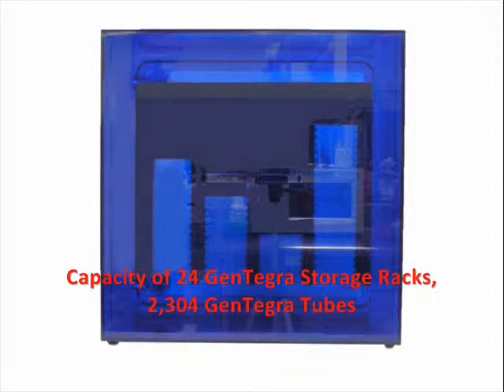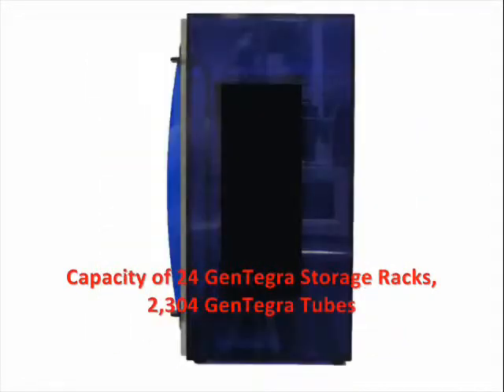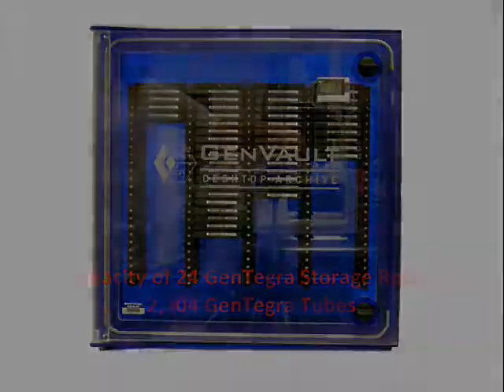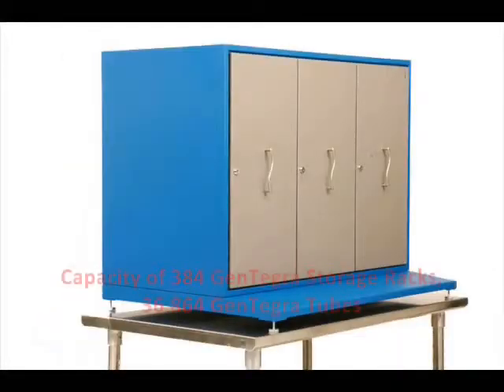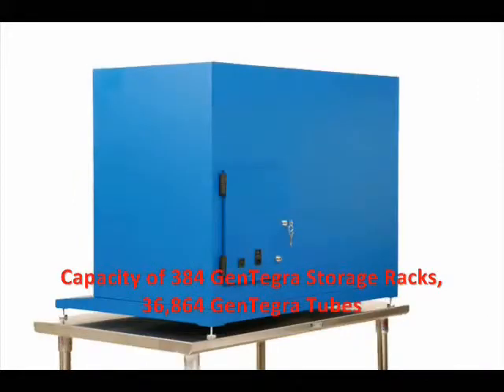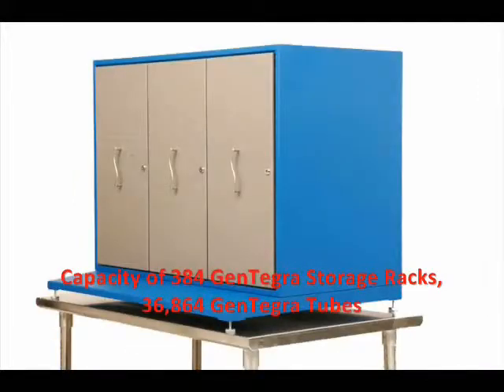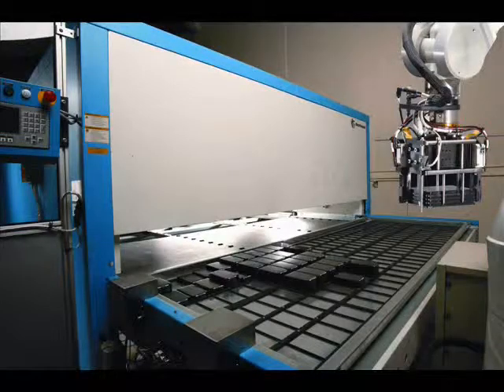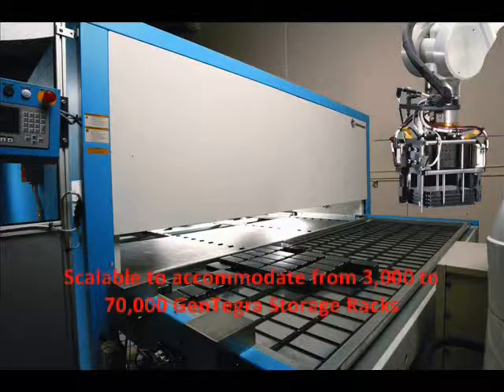Genvolt's desktop archive, our small storage cabinet, holds up to 24 Gentagra storage racks or 2300 tubes. The personal archive, our medium storage cabinet, holds up to 384 Gentagra storage racks or 36,800 tubes. Our dynamic archive scales to meet your needs, with sizes beginning at 3000 Gentagra racks up to more than 70,000 racks.